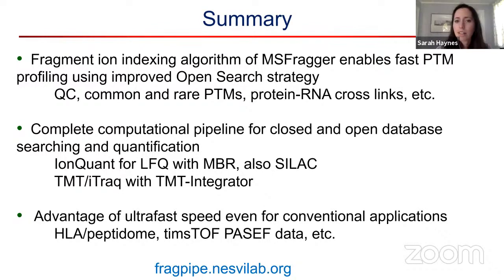Another question that I thought would make for good discussion is someone stated that it would be great if FragPipe integrates global proteome and phosphoproteome search to provide phosphosite stoichiometry or occupancy values. And they weren't sure if this is already working in FragPipe. Well, it's a great question. Anytime you do phosphoproteomics analysis or any PTM analysis in general, we typically look at the peptide level, but sometimes at the protein level. We have to normalize for the global abundance, right?